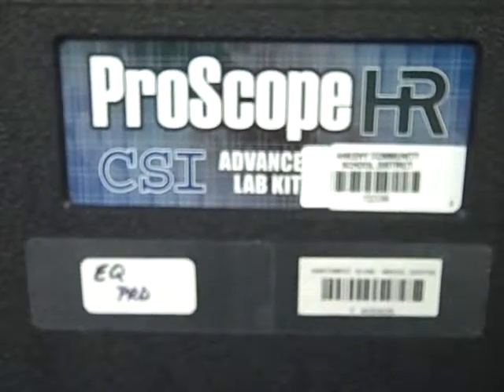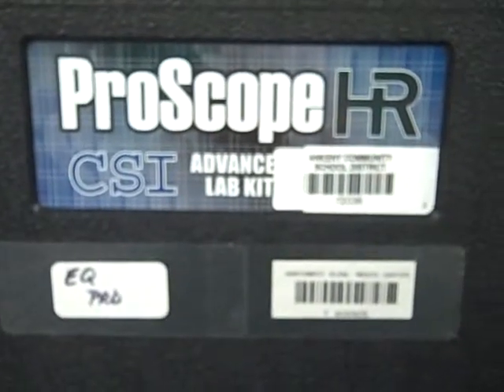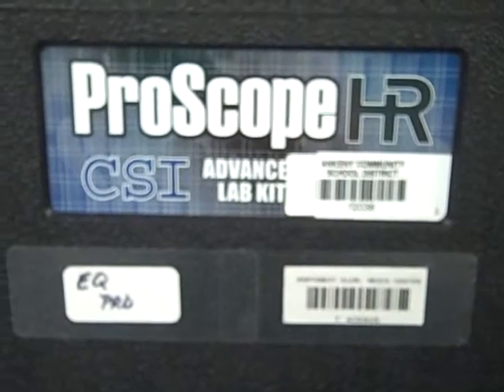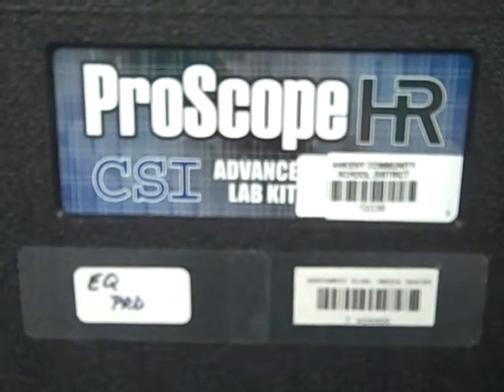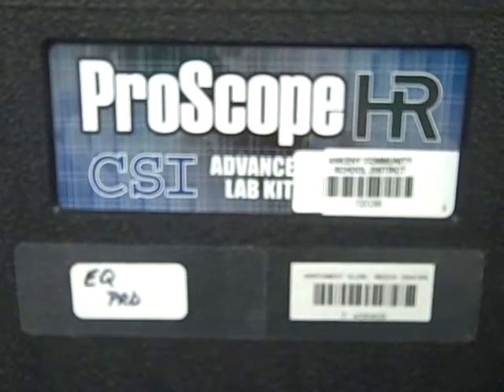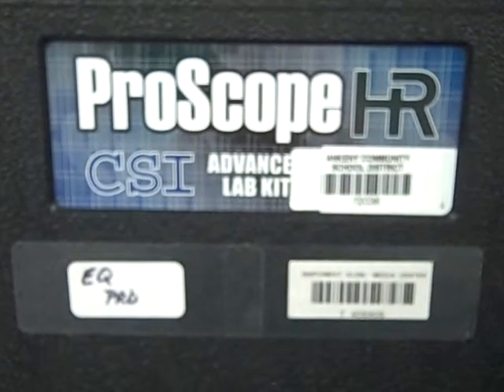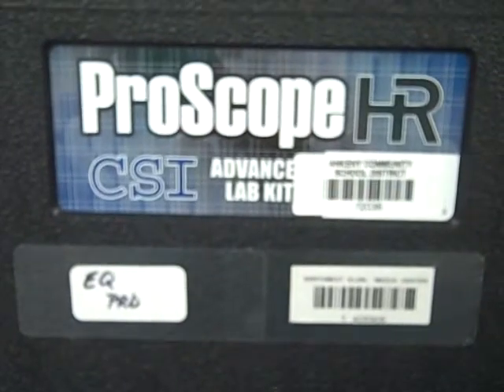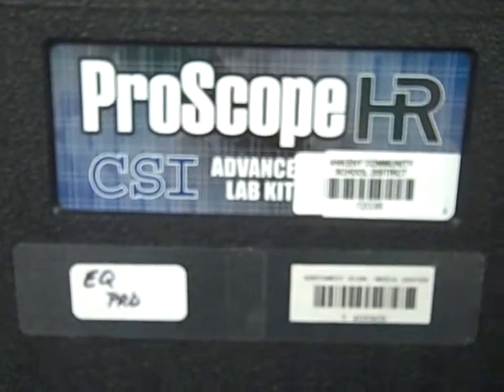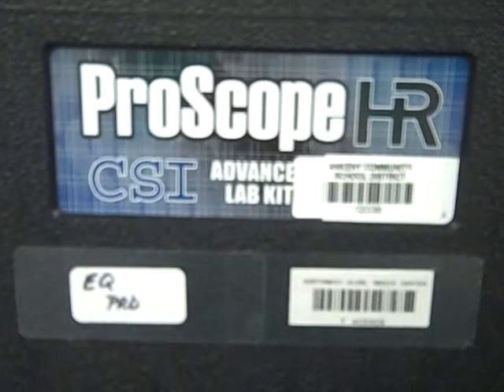This video clip is on how to use the ProScope microscope. It's a digital microscope that you can use with your class and your computer and project whatever you're zooming in on up onto your computer screen.